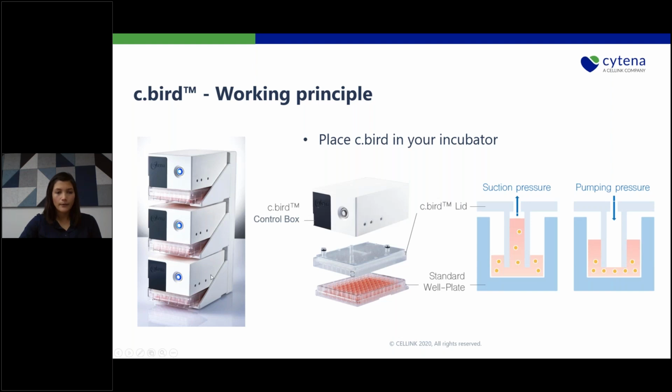So with this stack, you can incubate 3 different plates, and the whole docking station, including the control boxes, can be put into a normal incubator.